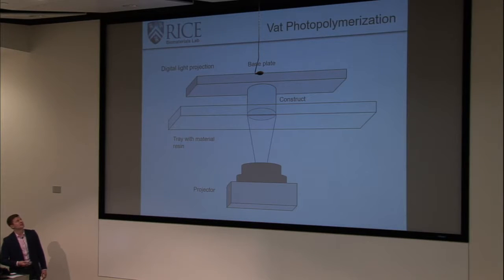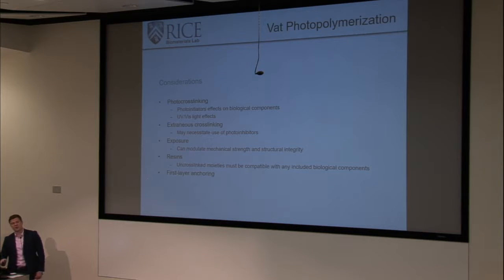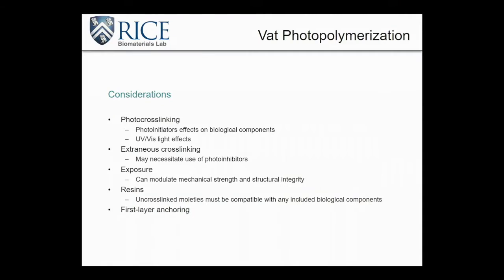In addition, a very similar technique is using digital light projection. Instead of using a single laser to do a single point at a time, you use a projector to cure an entire layer at a time. Otherwise, this works more or less the same, where you're curing this scaffold layer by layer attached to a base plate that will raise out of your tray with your liquid material after each layer is cured.